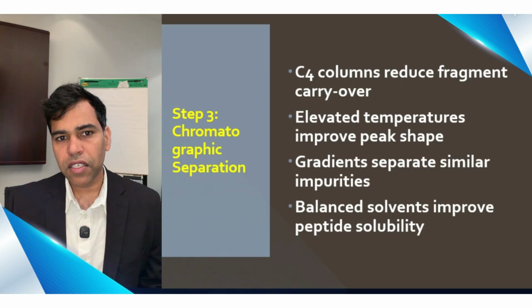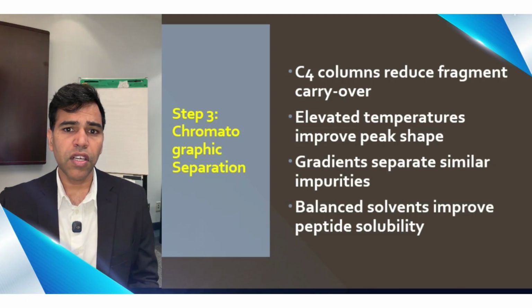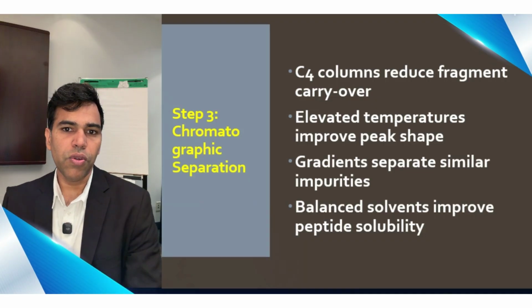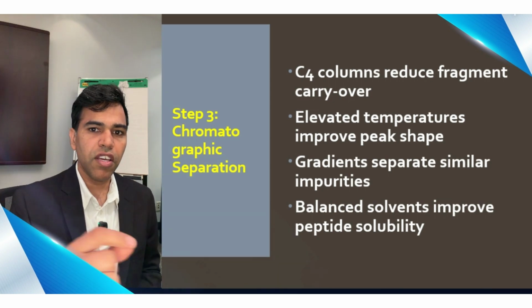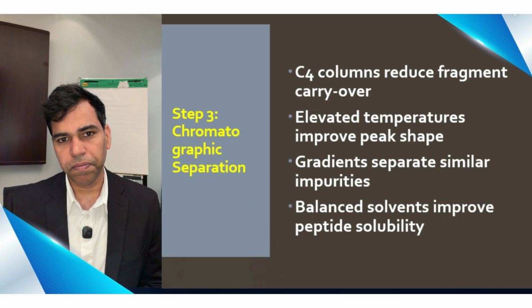Gradient design matters more than people expect. The difference between a gradient that resolves two closely related impurities and one that coelutes them is often the difference between a clean data package and an FDA query asking you to repeat the entire separation.